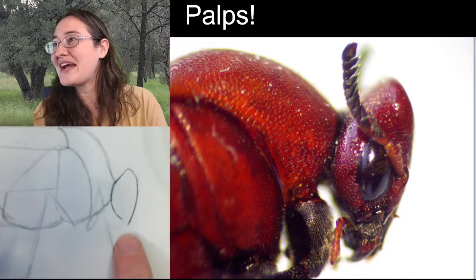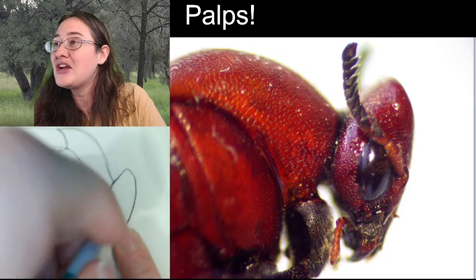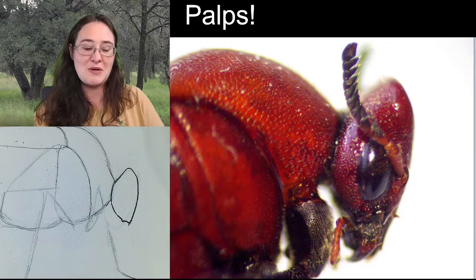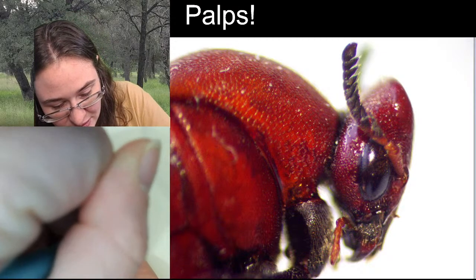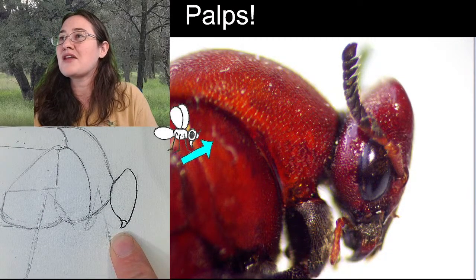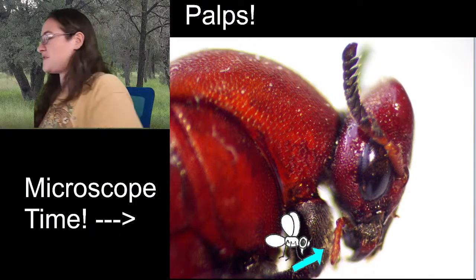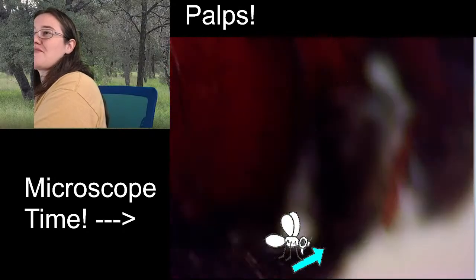So when we get down here to the bottom of our Rhipiphorid's head, we're going to want to add our mandibles. So a lot of times I will kind of end the head pretty abruptly. That's going to be where the mandibles start. And then I'm going to add these, that kind of little curved triangle here. And that is the mandible that is right about here. All right, and then underneath it, you've got this palp. So let's go ahead and zoom in on the palp and see how many segments it is and what it looks like. We can zoom in further.